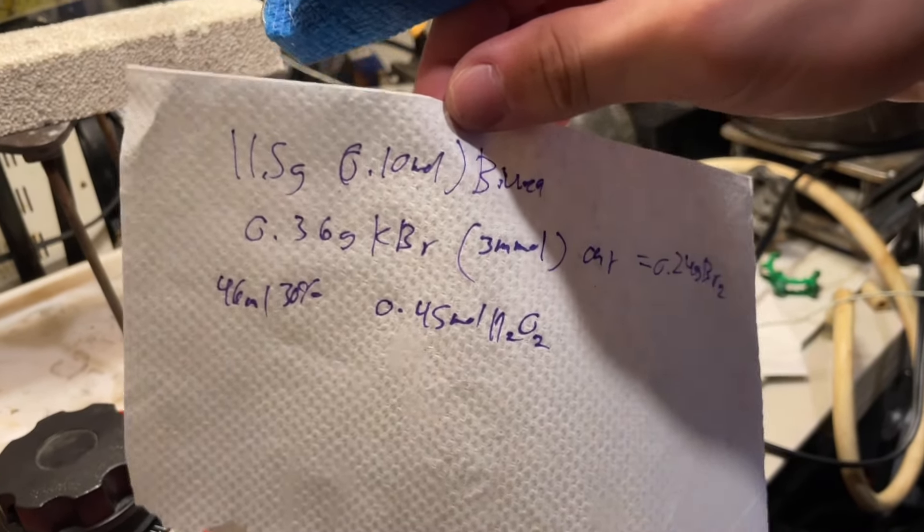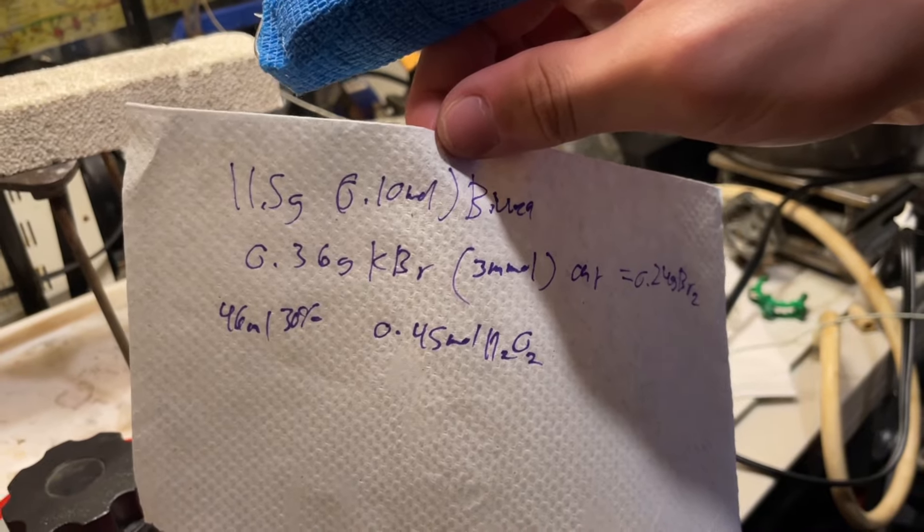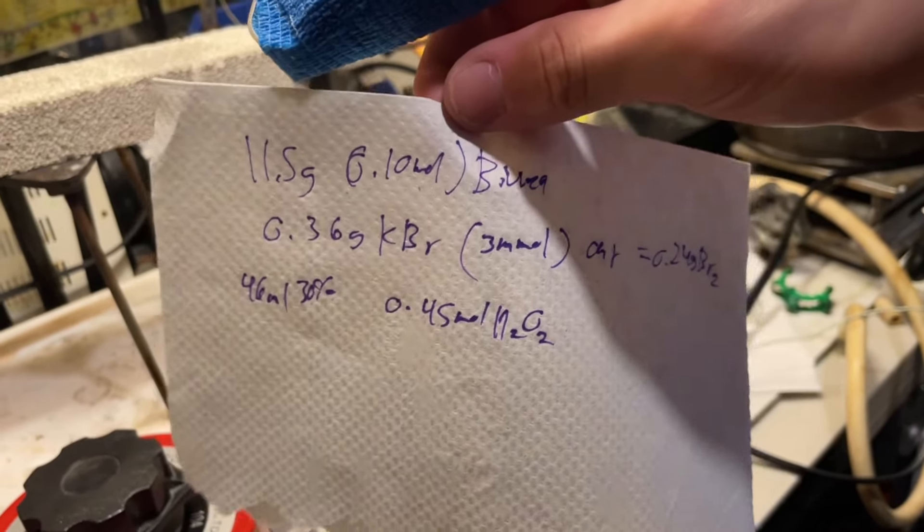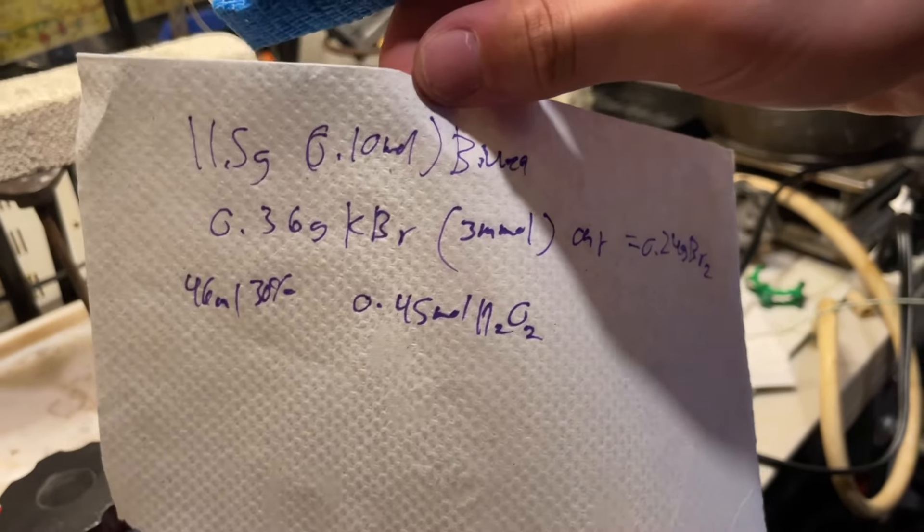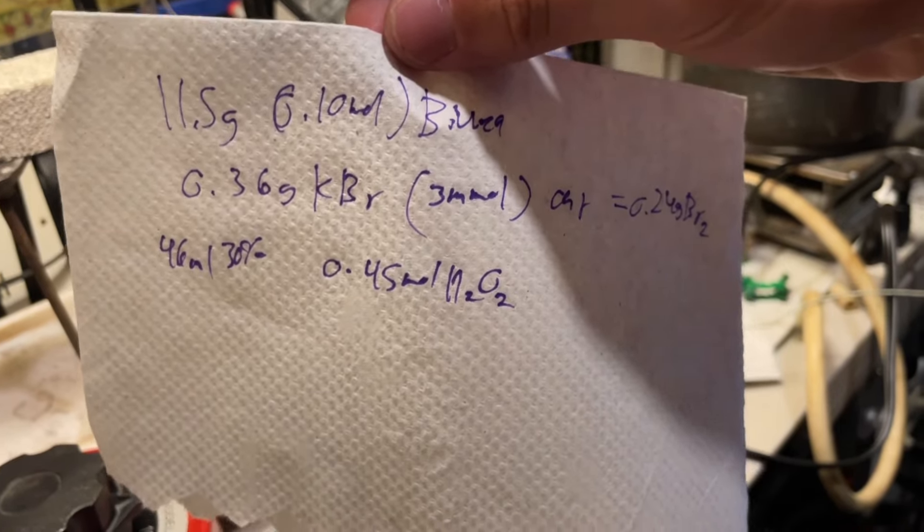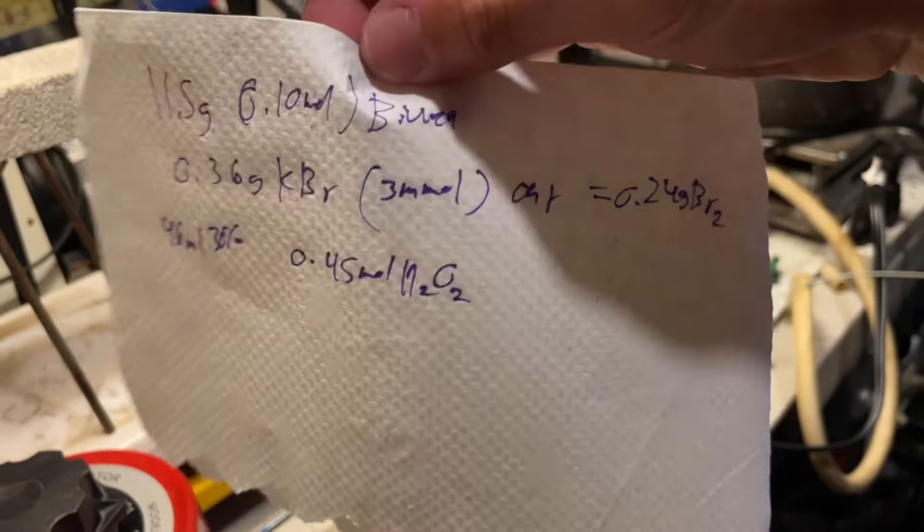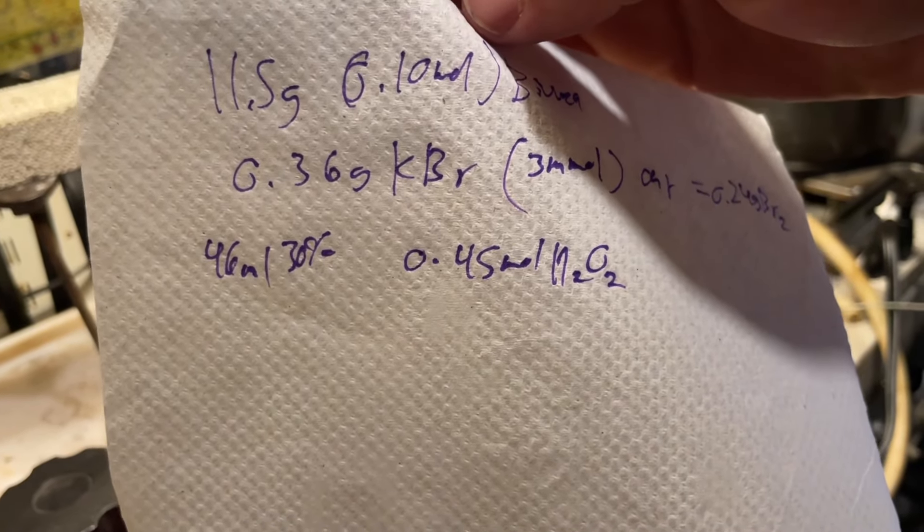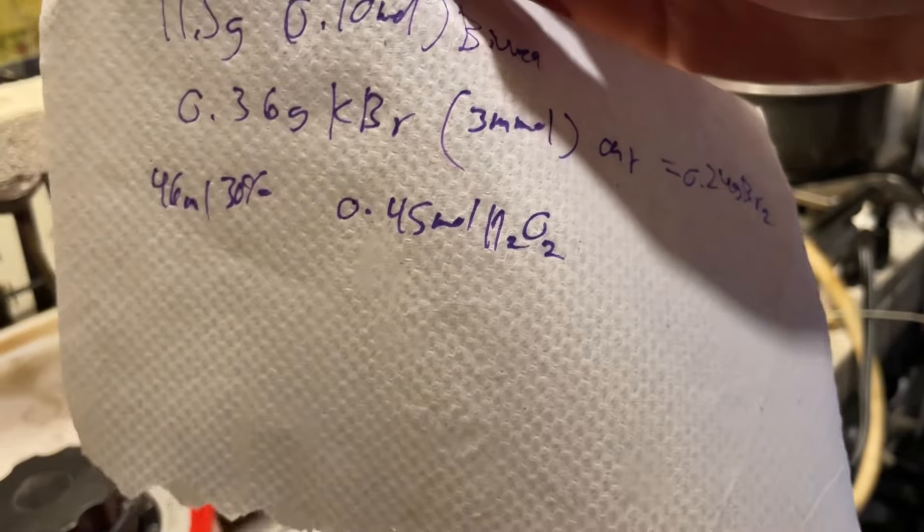Here are the back of the napkin calculations I did for this. So this is scaled up from the paper by five. 11.5 grams, which is 0.1 mole of biurea. 0.36 grams of potassium bromide as the catalyst, but I didn't have that, so I used 0.24 grams of elemental bromine, and 46 milliliters of 30% hydrogen peroxide, which is 0.45 moles of hydrogen peroxide as the oxidizer.